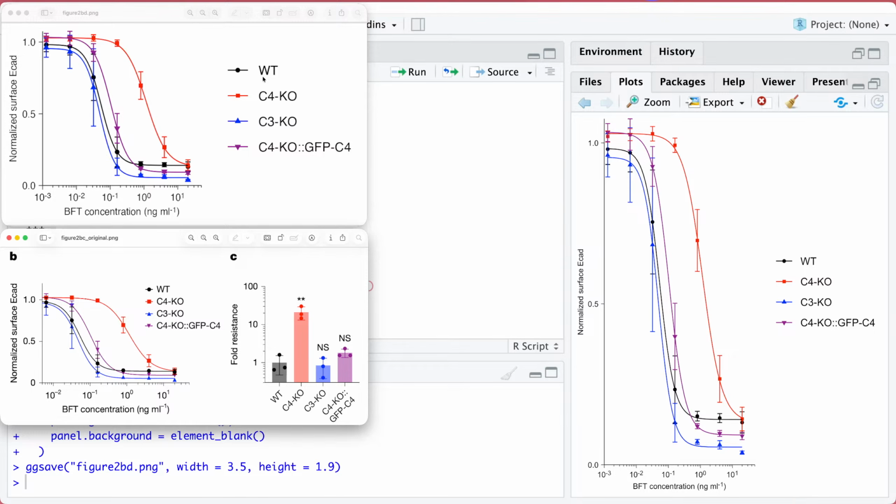So let's go ahead, and the legend here is using almost half of the plot. So what I'd like to do is kind of like what they did here, where they were able to shrink down the font size and the spacing between the legend elements, and then move it into the plot, right? Their Y title expands to the height of the plot, and that is because they have all this extra white space up at the top that I'm using, right? So I'm trying to use all the space I have available.